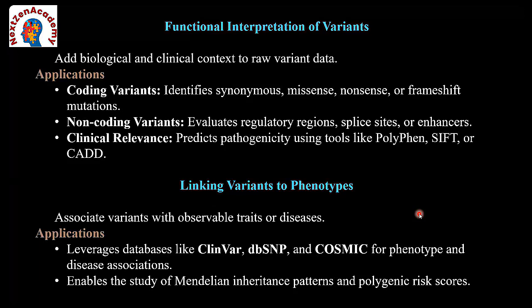In the field of precision medicine, as you all know from the beginning, one of the main applications of NGS is to do precision medicine studies. The treatment is tailored based on individual genetic makeup.